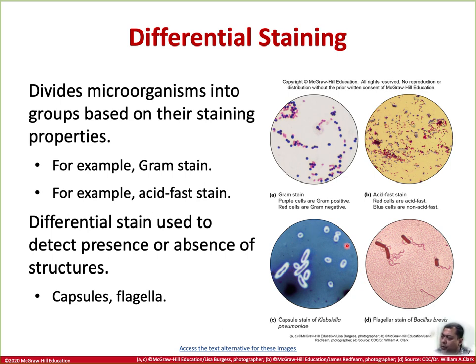With this particular negative stain, one thing you have to remember is why the polysaccharide capsule that you're seeing in white is colorless when you are using an acidic dye to stain the background, which is the glass slide, or using the basic dye to stain the bacteria. The reason is that the polysaccharide is actually neutral. It is not charged. Polysaccharide is neutral in charge.